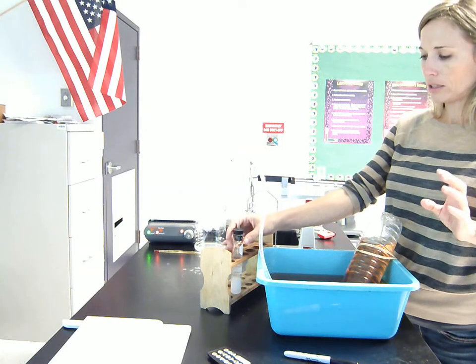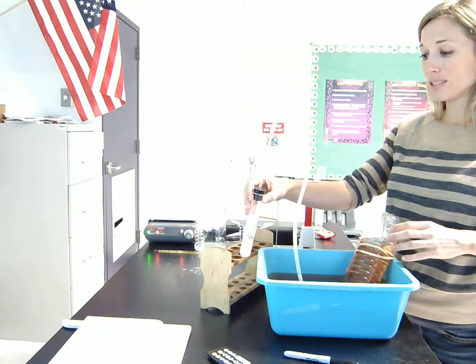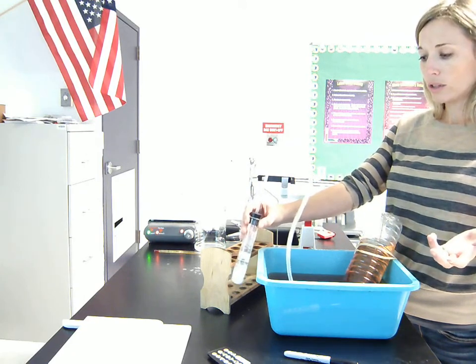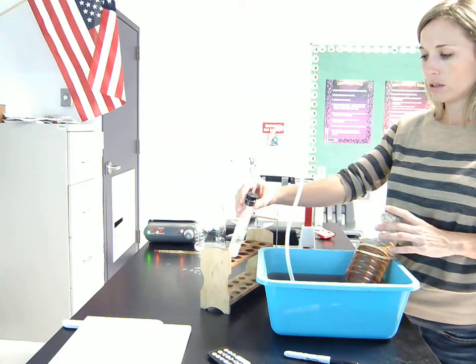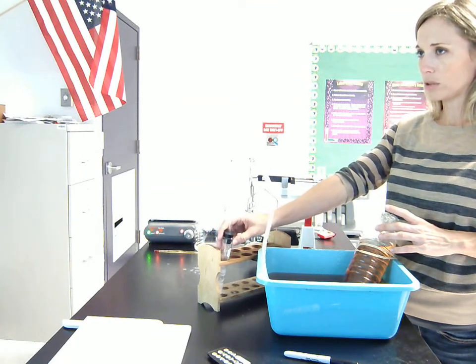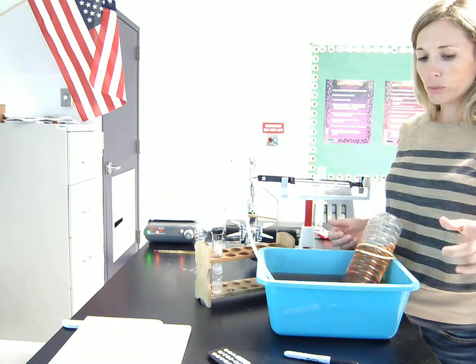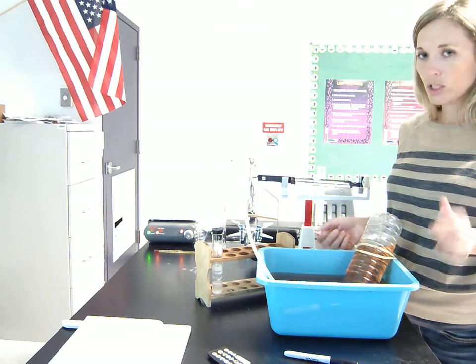This is the part of the video where you can fast forward because we're going to need to wait. The book says 10 minutes. I might wait about 8 minutes. But we've got to wait a little while for the reaction to finish. If we don't wait long enough, then we're going to get inaccurate measurements at the end. So we want to wait long enough. We want to make sure that the reaction is at least 90 to 95% complete before we take our numbers. So I'm going to let this sit. The video will keep recording, so what you can do is now fast forward until the part where I'm going to take the measurements at the end. So I'll be back in a couple minutes.